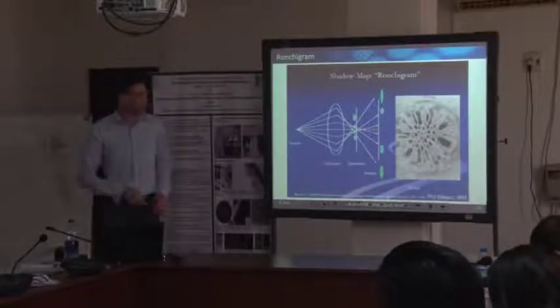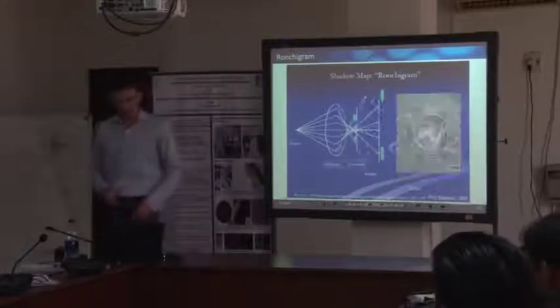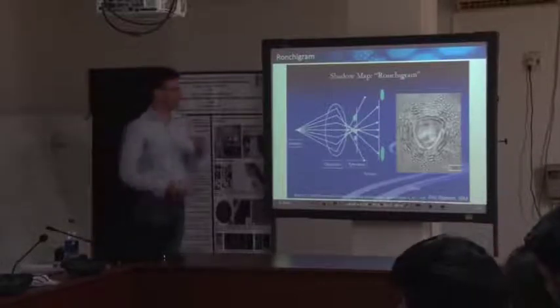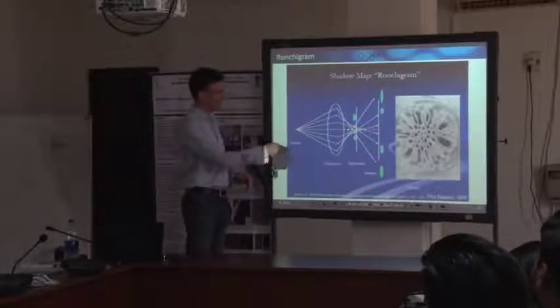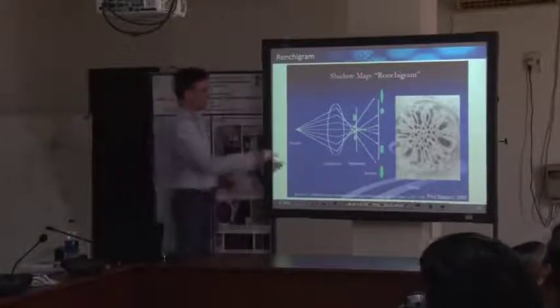And the closer you get to focus, the larger will be the magnification of our innermost region of the sample. So here we have a finite magnification of this inner region of our sample, depending on the distance of, let's say, the focused probe to our sample.